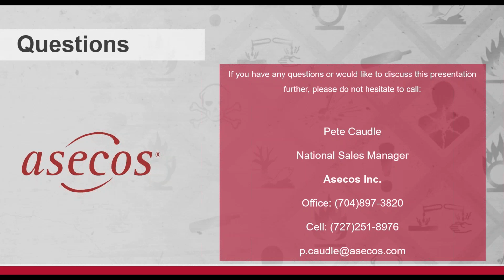All right. Question from Wincy. Have you compared the Aseco's gas cylinder cabinets with other suppliers' cabinets? How are they different? Yeah, perhaps I'll let you handle this one. Okay. Just in general, we all have our own technologies. The key is to find equivalent fire resistance. So 90 minutes of fire resistance, regardless of how that company achieves it. If they have an EN tested mark and they've done 90 minutes, it's only EN because the European standard is the only one that sets the 90-minute criteria.